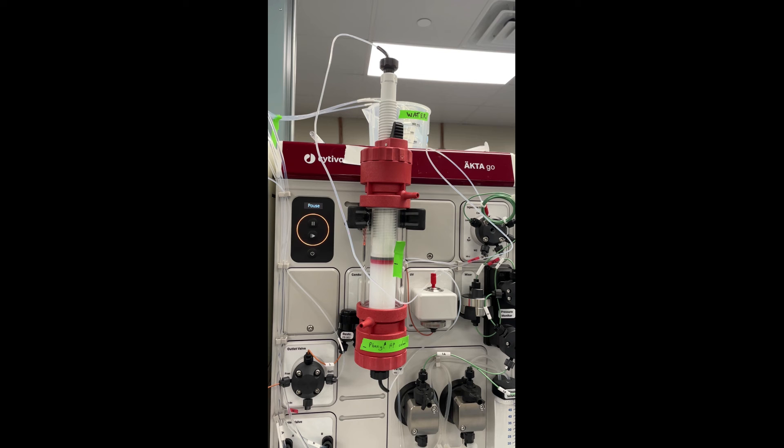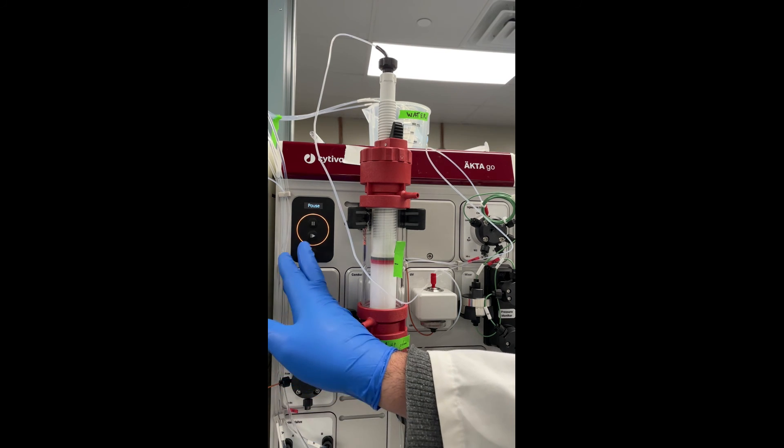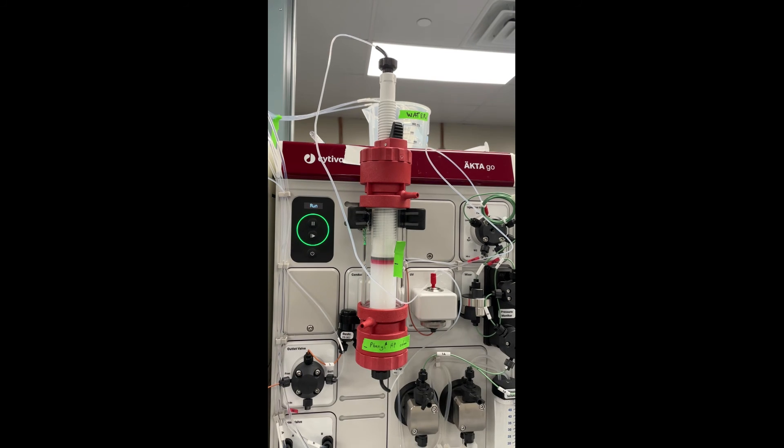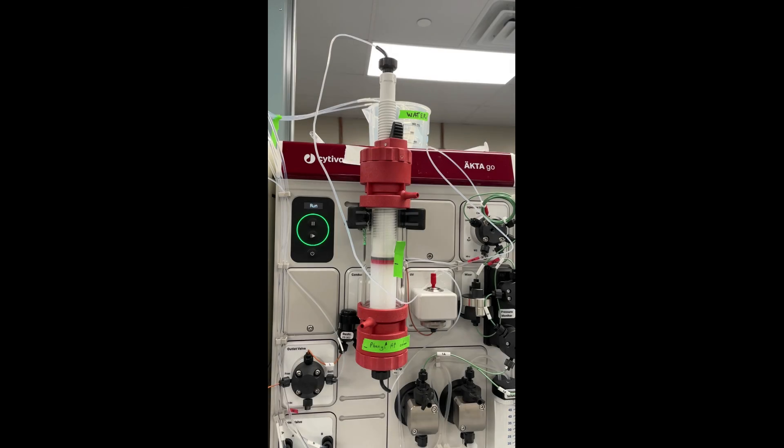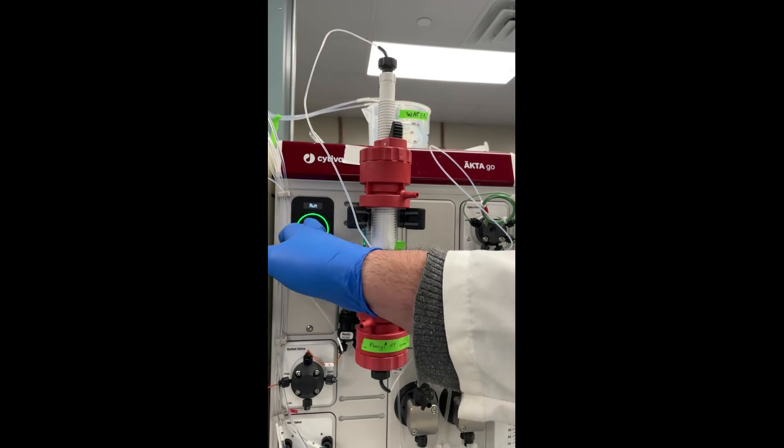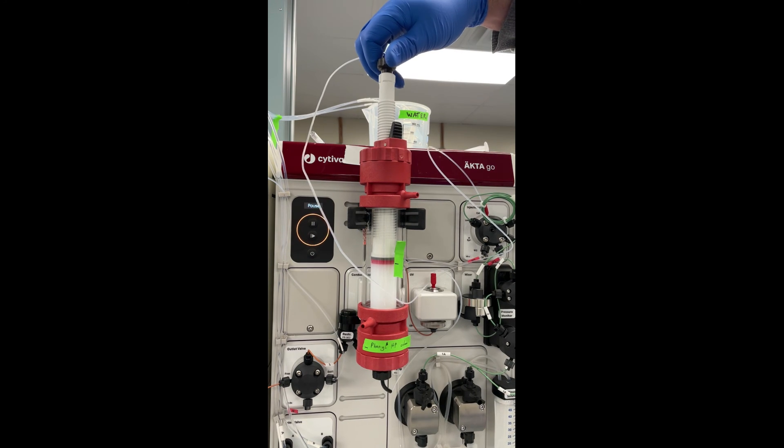I like to run the column at a slower flow rate than what I packed it. So I changed the flow rate to 6.8 mils per minute, about 75% of what I packed it. And then I pressed the play button on the system. I stared at the column for a couple minutes thinking that I wanted the adapter just a little bit lower than the mark.